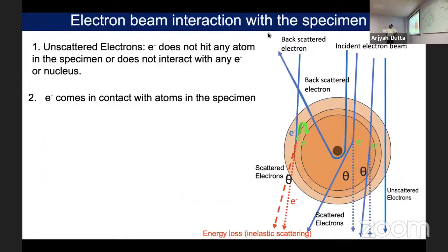Yes. So how much time does it take to damage? Like, what is the time duration for an electron beam to damage the sample? Sometimes it is very difficult to tell how much time it will take. Just as an example, in material science they are generally using electron doses of 200, 300, 400 electrons per angstrom square per second. For a biological cell sample, we are using only 40 electrons per angstrom square, in 10 seconds.